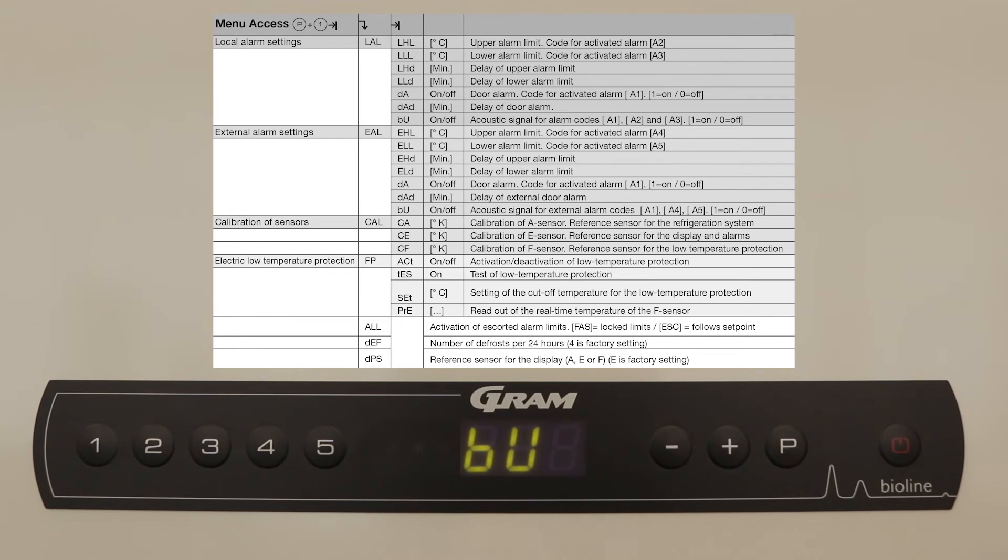The acoustic signal set to on will allow for the addition of an audible signal on top of the visual light and alarm code signal on the LED display should your unit fall outside of the set alarm parameters.